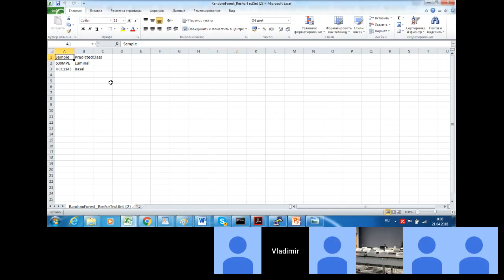So let's try to see what are these questions, and you're welcome to have your own experiments with all these data sets, to test various methods, to compare them.